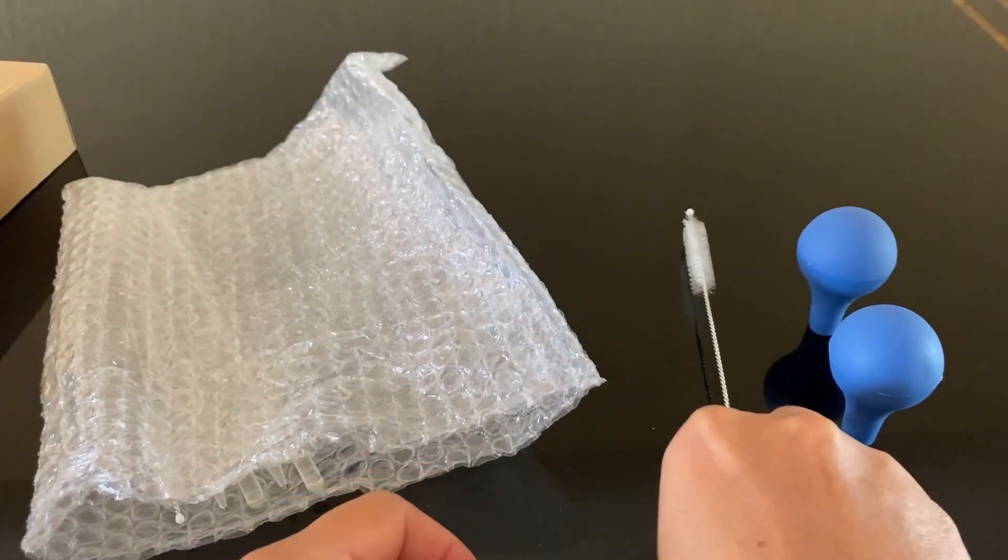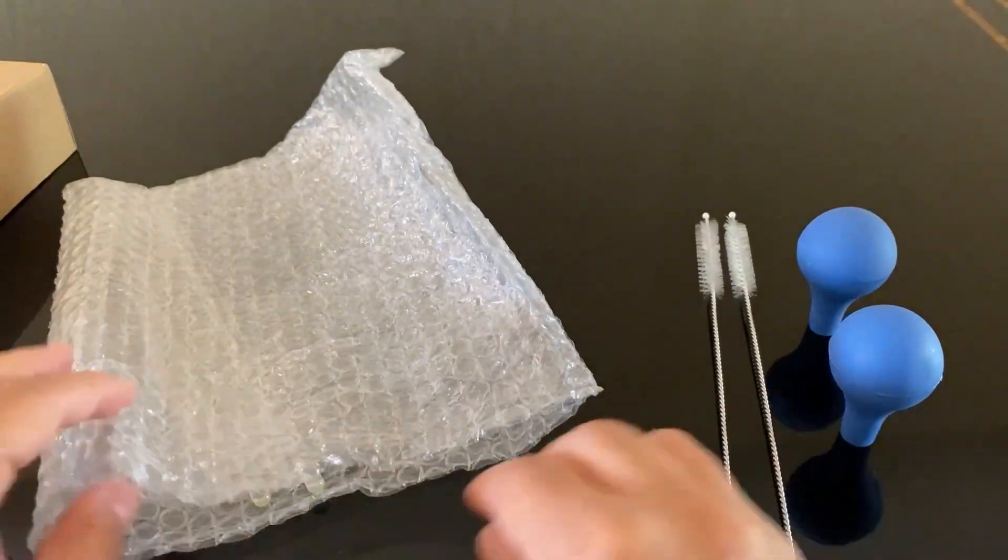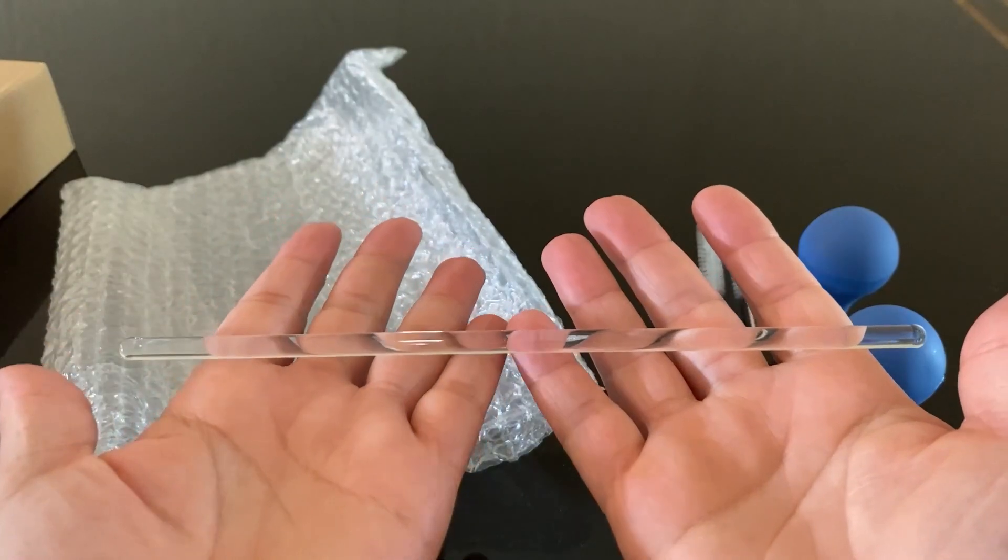So these are the cleaning brushes. There we go, they are nice and neat. And here we have our glass stir rods, which are about 20 centimeters in length, nice and good quality.